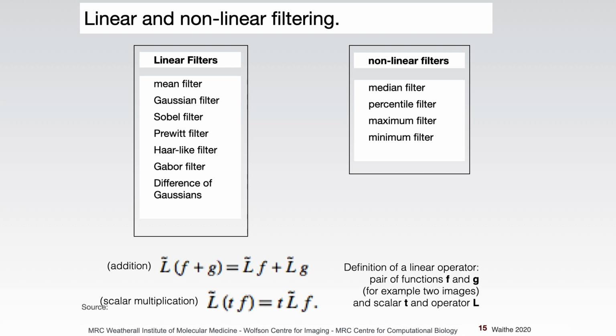So linear filters are the real workhorse, and nonlinear filters are specializations that do something a little bit funky, and so you can't naturally reverse them. It's not so important that you grasp that now, but it comes up a lot in mathematics and image analysis: the idea of linear transformations and nonlinear transformations. The convolution is an example of a linear transformation, and that's what we were doing with filtering. So let's go into linear filters.